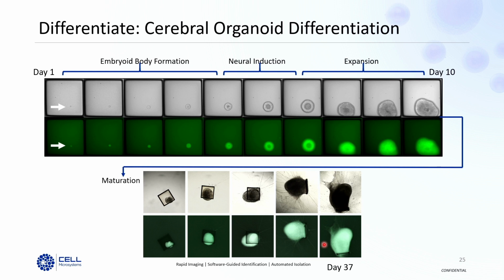So, with every suspension cell line, we usually recommend our customers do some plate-based coating optimization. So testing multiple different coatings, sometimes coatings in combination. But usually once we figure out the optimal coating material, PDL, PLL, PLO, or some sort of combination, and know how long that coating keeps the cells stuck, we can really optimize the experiment to eliminate any movement of cells around the array.